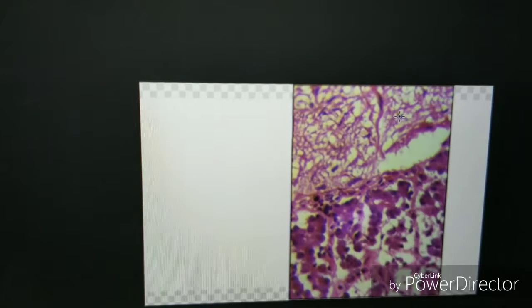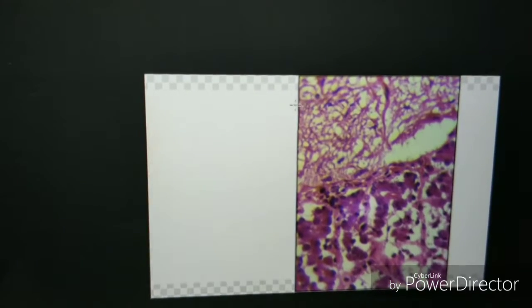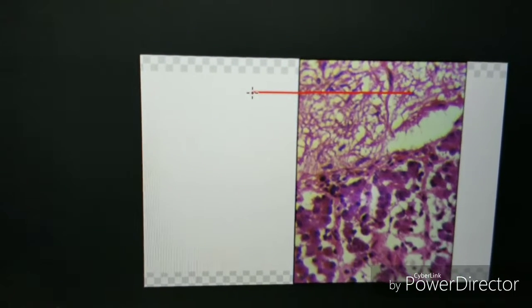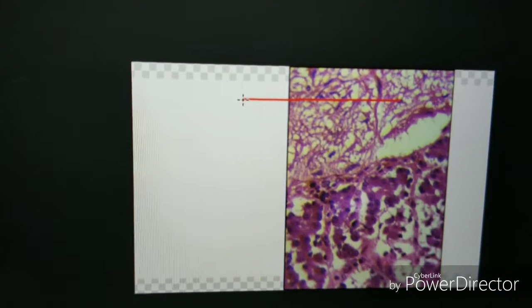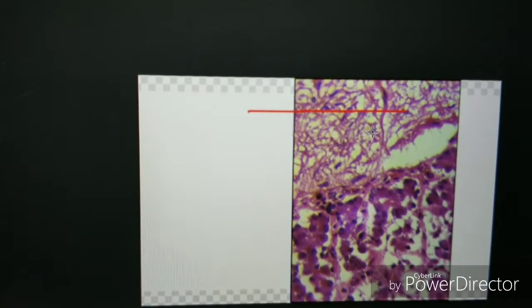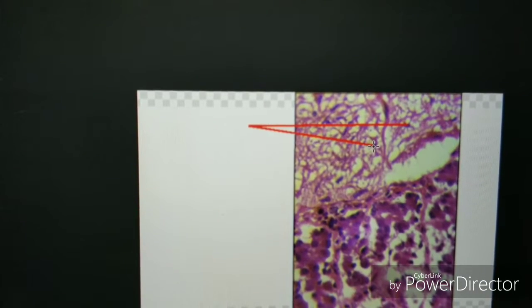I'll click once here, and then I'll click once over here, and it immediately puts a line. And then I see that there's other ones that are very noticeable, so I might want to do another one. Since I've already clicked here, I click to another one that I want, and let's just say this one right over here, which is also very noticeable.